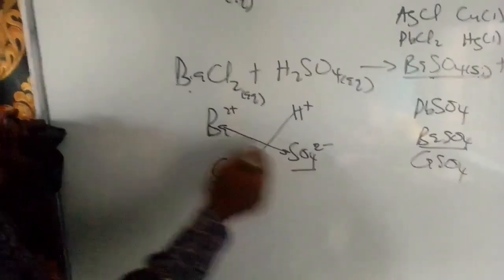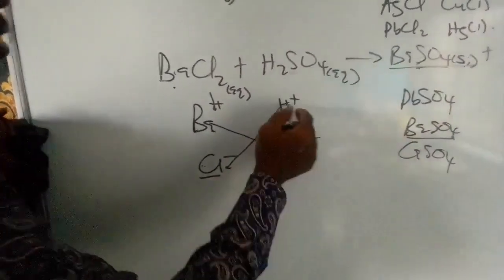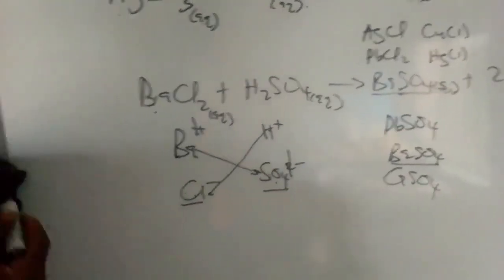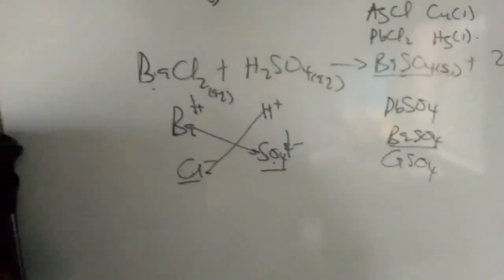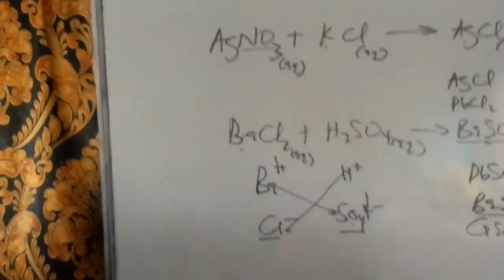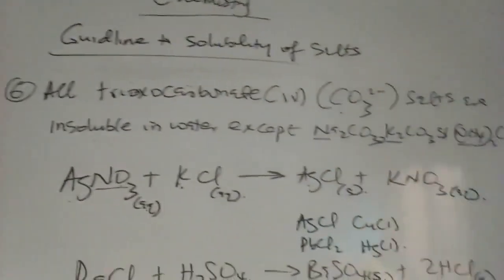So it involves a change of acid radicals. When you change, you have valency cancel, you have this. When you bring this one together, you have that. So we can say it involves a change of acid radicals, and this reaction is normally used to produce insoluble salt in the laboratory. It's one of the key methods of preparing insoluble salts in the laboratory, by using double decomposition, by using precipitation reaction. So now we're going to look at the practical aspect. We're going to do some simple practical to demonstrate this reaction.